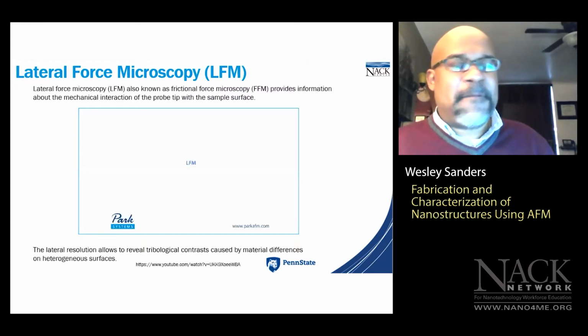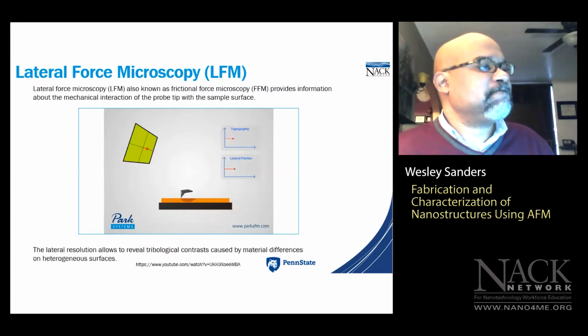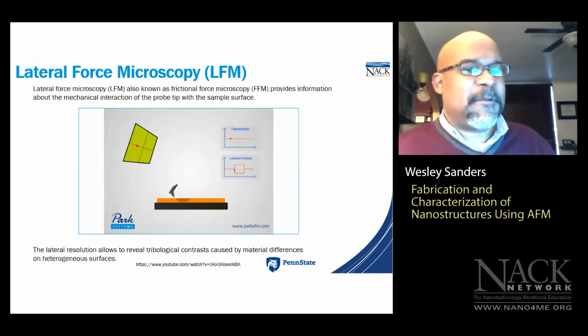LFM. While more traditional AFM techniques focus on vertical deflections of the cantilever to image the surface topography, lateral force microscopy, LFM, instead focuses on torsional deflections of the cantilever as it scans across the surface. The amount the cantilever twists as the tip is dragged across the sample surface provides useful insight into the frictional force and adhesion properties of the sample.